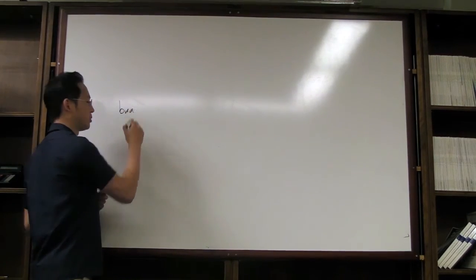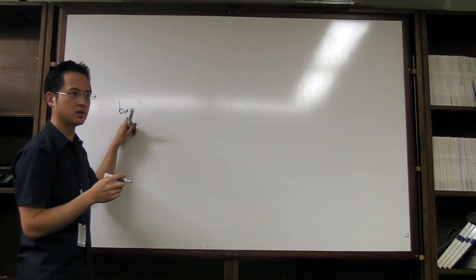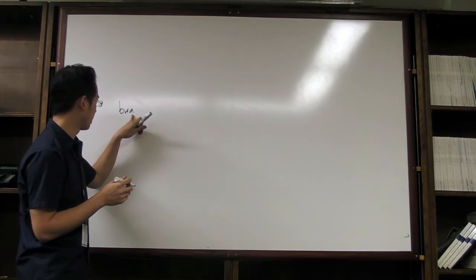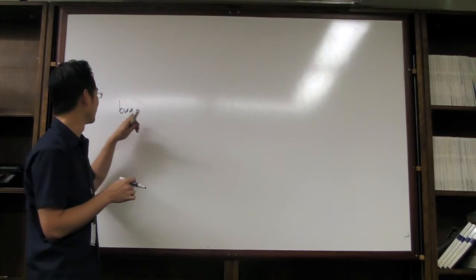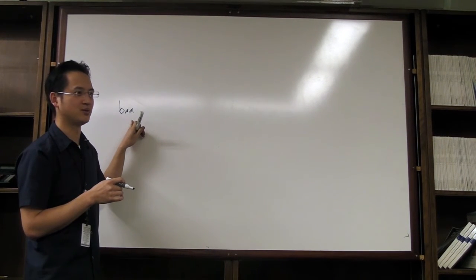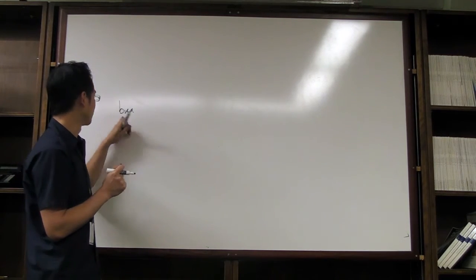BWA is a very popular one. The Broad uses it extensively. This is sort of the industry standard. What it stands for is the Burrows-Wheeler Aligner. And I will leave it up to you, if you really want to figure out what the Burrows-Wheeler transformation is, to go onto this website and you'll find out what the algorithm is. And you can pull up the paper as well, because I'm in no capacity to explain the algorithm. But this is the most popular one.